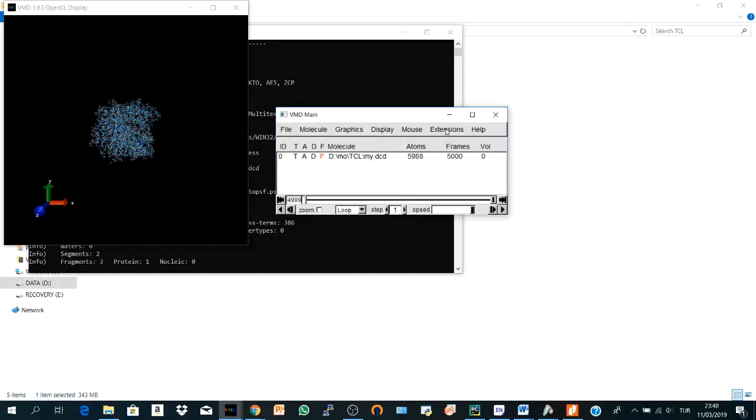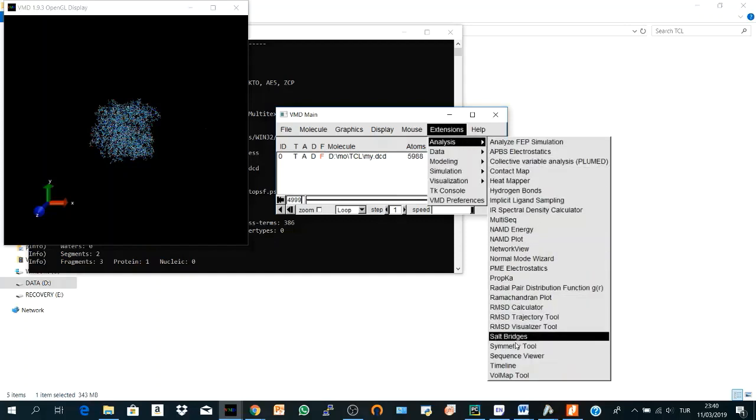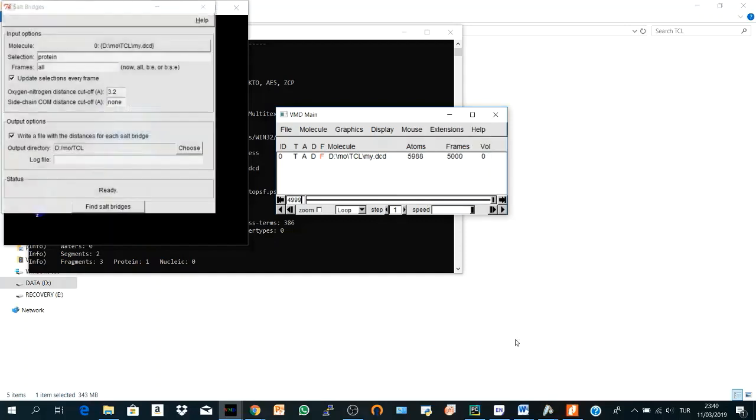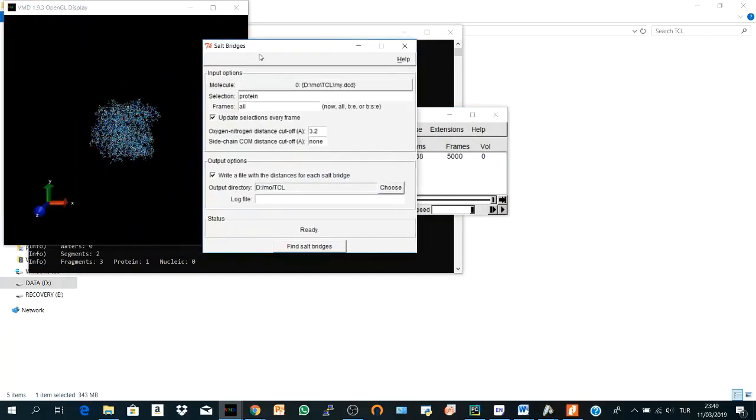So let's go to Extensions, Analysis and here we have Salt Bridge. It's quite simple. The molecule that we have is our trajectory. The selection, I will choose protein.